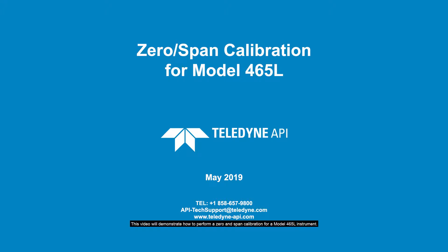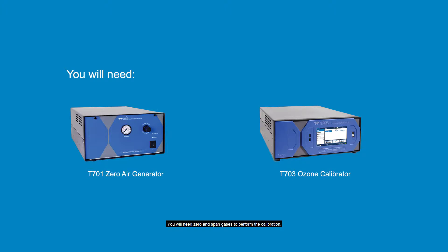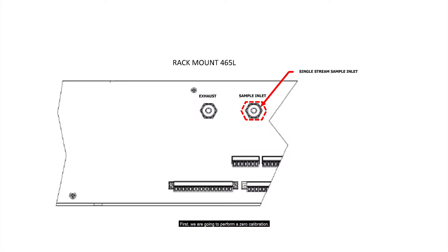This video will demonstrate how to perform a zero and span calibration for a Model 465L instrument. Periodically performing a zero calibration and span calibration is essential to keep your instrument reliable and accurate. You will need zero and span gases to perform the calibration. TAPI recommends using one of our zero air generators and calibrators.